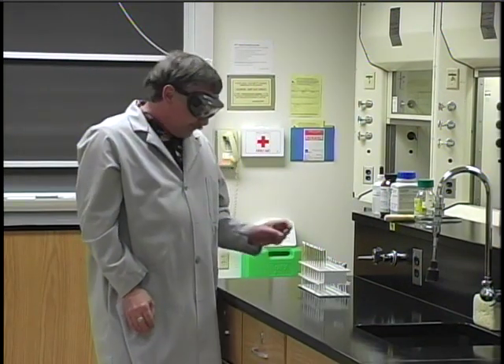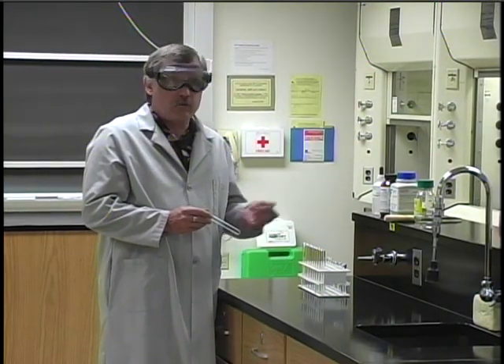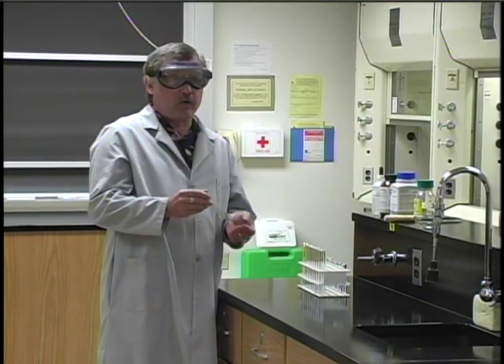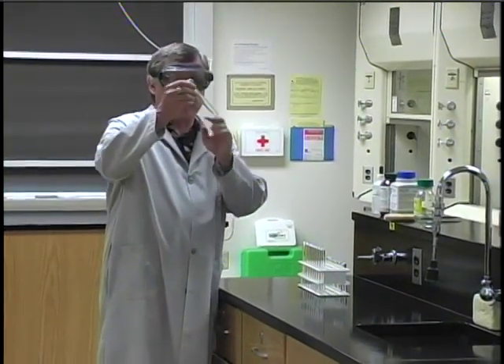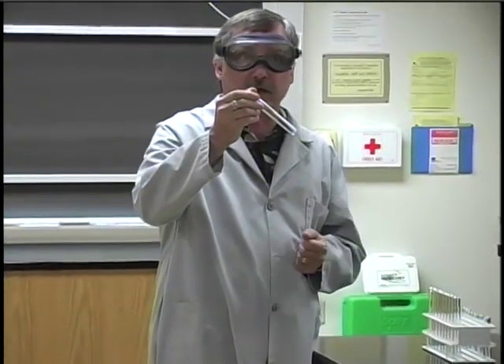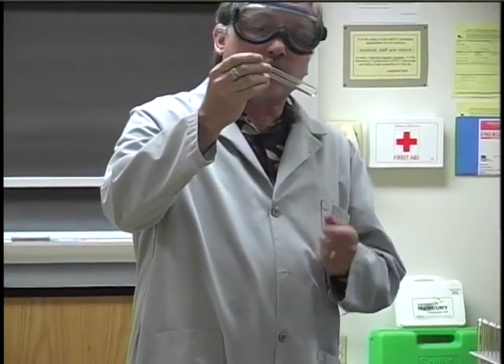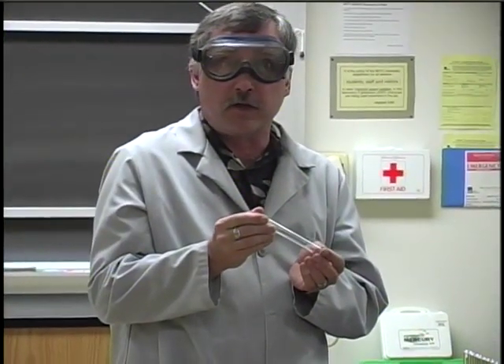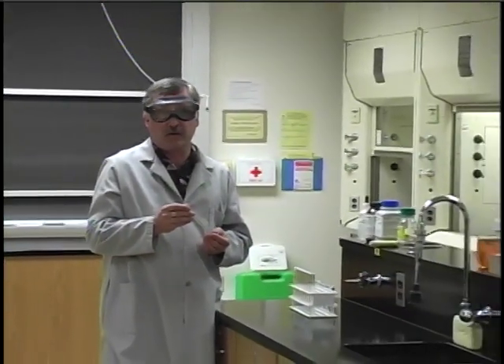Another way to prevent contamination is to inspect the glassware before you use it. Other students will be using your lab station during the semester, so before you use the equipment, look at it and make sure there's no chemical residue left over that could cause contamination. You should also inspect the glassware for chips or cracks that might make it unsafe to use. If you find any chips or cracks, tell your instructor and they'll replace it.